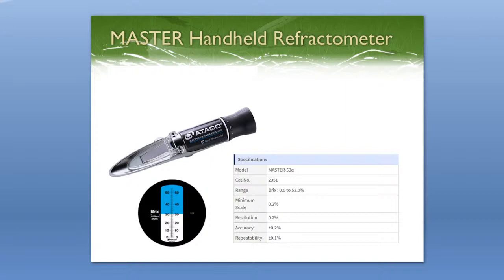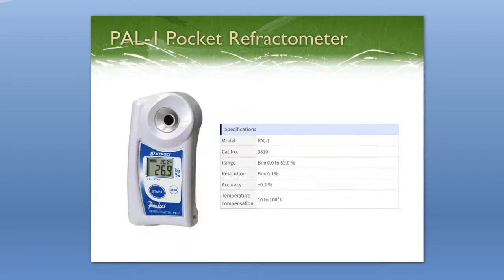The most familiar refractometer for this industry is going to be a handheld analog refractometer — the traditional style. At Atago, we're well known for our MASTER series handheld refractometers. You put the sample on the glass, put the daylight plate down, look through the eyepiece, and you can see the field of view — a black background with a scale. You read where the boundary line is between the white and the blue. A lot of times with samples, especially starch, they're pretty opaque and it can be hard to get a really clear boundary line, so many people prefer something more digital.